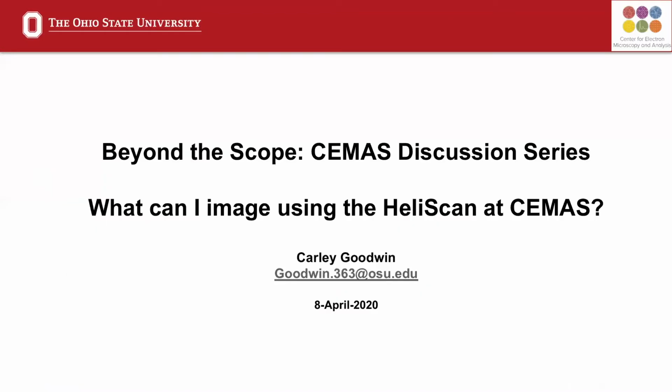Today I'm going to cover a brief overview on the HeliScan MicroCT and then go through a series of examples showcasing how CEMAS users are utilising the versatility of the HeliScan MicroCT to meet their research needs.